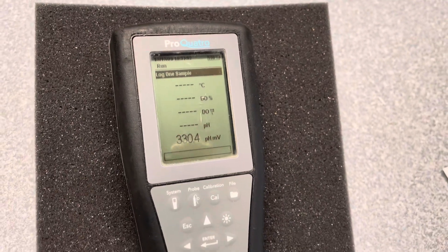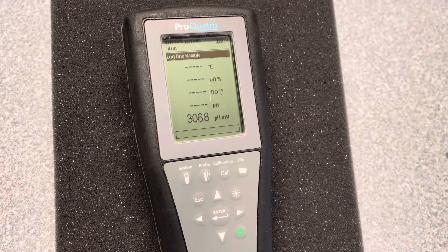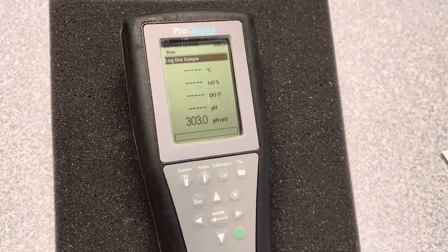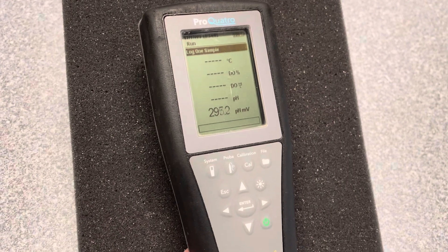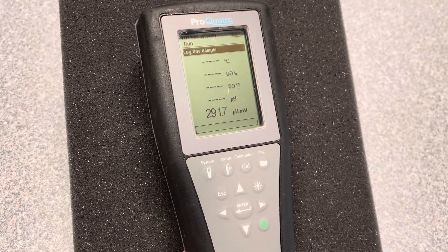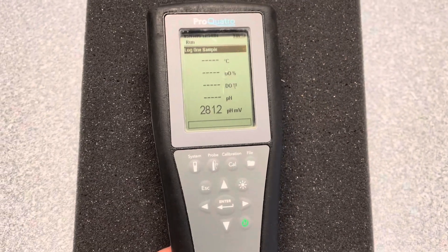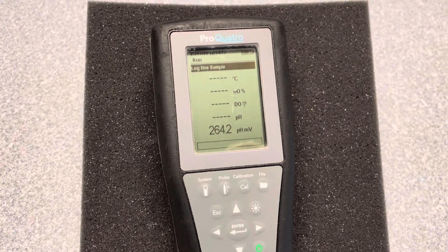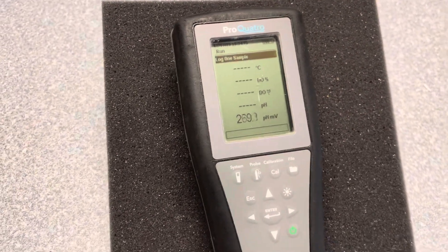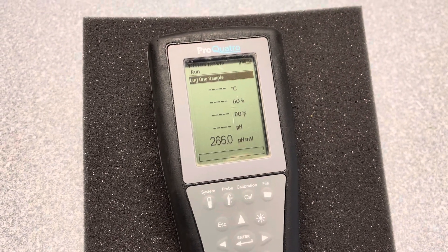Today we are looking at a Pro Quattro, and what we discuss is also going to be true of the Pro Plus. What we're going to do today is learn how to turn on and off the individual sensors on a cable, especially if you're dealing with a Pro Quattro. And also, once you have a sensor turned on, how to change the mode.